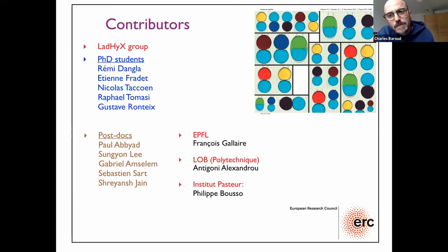You can play different games. Sorry? There's maybe a trade-off. If you make it too shallow, then it's a poor anchor. But if you make it too deep, you have optical aberration. Yeah, well, I mean, you have actually a range of parameters to play with. You can make it shallow enough that it's flat on the bottom, but it can stay sufficiently strong.